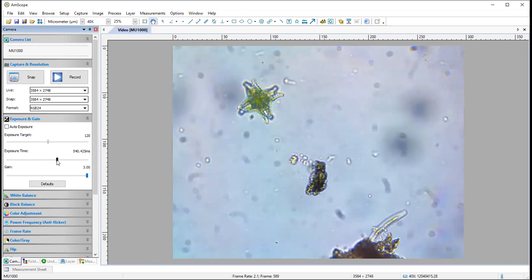especially at high magnifications when you might have a hard time getting enough light. However, that means in this case, it's going to take almost half a second to take the picture. Make sure that you don't bump the microscope in that time. So you might want to take your hands off of the table or something like that. And that might be just generally problematic if your sample is moving, like if there's a lot of water, there might be some small animals moving in there.